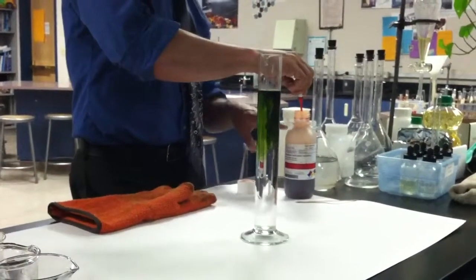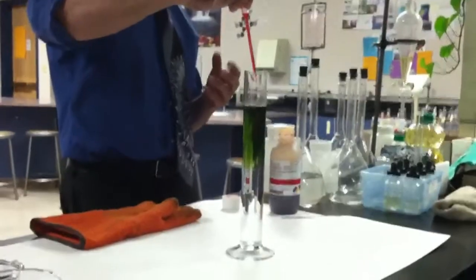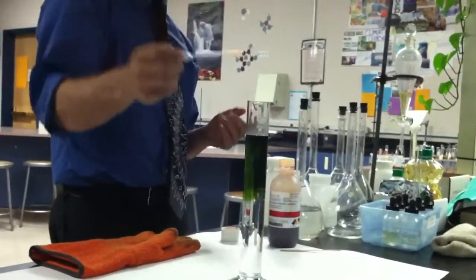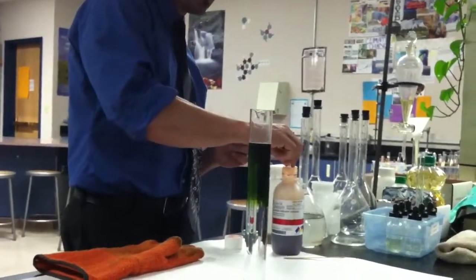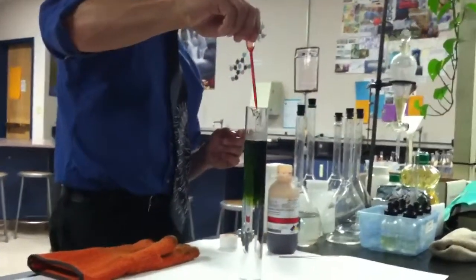So this indicator is a universal indicator, meaning you can pretty much think of it as a mixture of all these different indicators, which will change different colors. And when it's neutral, it's going to be a green color. And so I'll add just a little bit more.